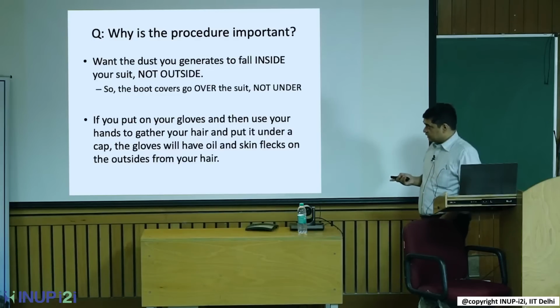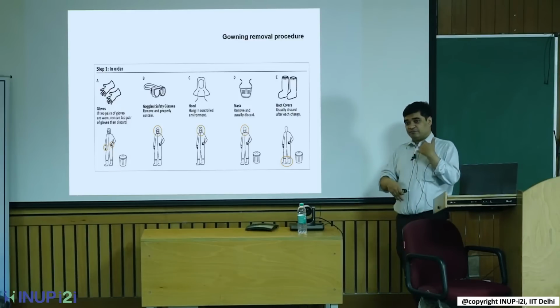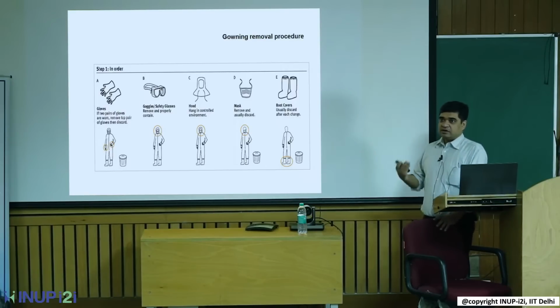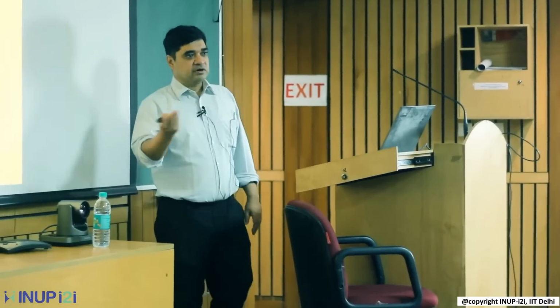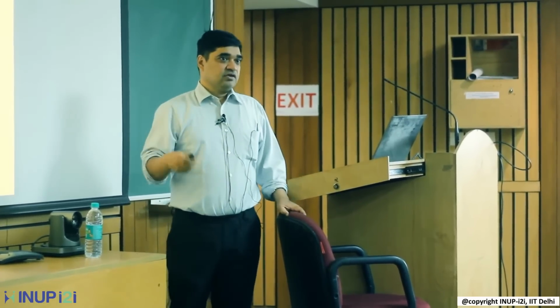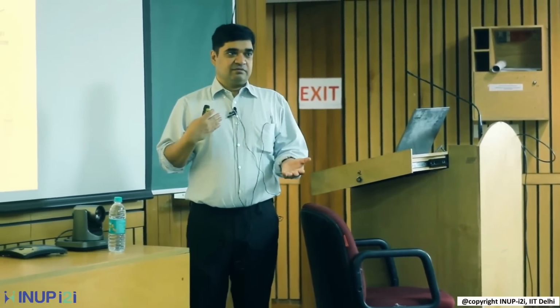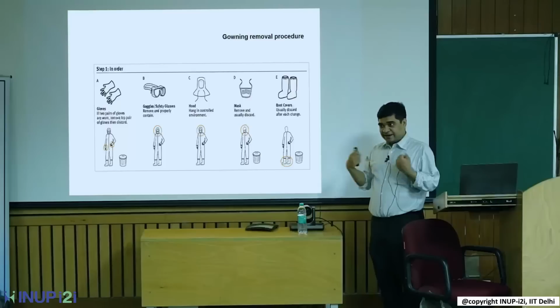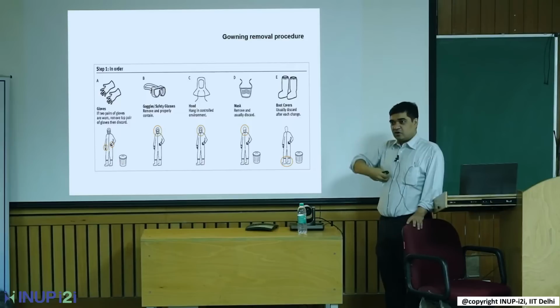I think this I have already covered. Gown removal procedure is the opposite. Why are we so particular about gown removal? It's because in a research facility these gowns are reused. If you are going into a clean room 5 times in a day, you are not wearing a new bunny suit every time you go inside. So you are reusing it. You want to make sure that you remove it in a way that dust doesn't come in. Suppose I remove my hairnet first and then I remove my coverall. There is a time when that dust is falling from my hair onto my coverall, right.